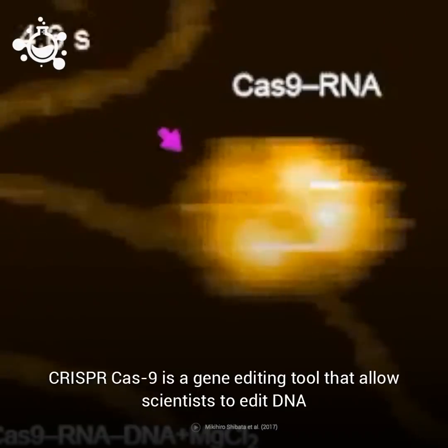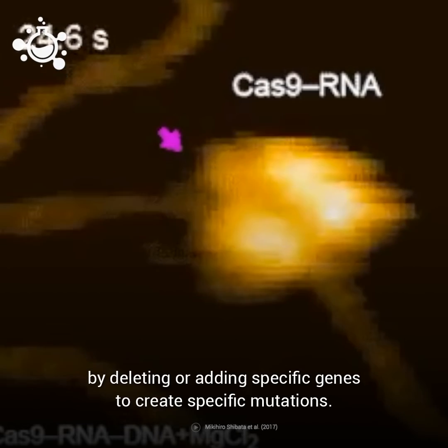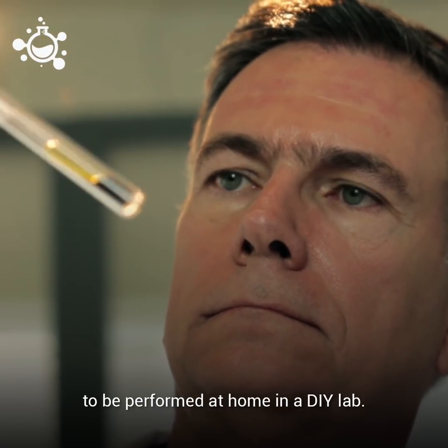CRISPR-Cas9 is a gene editing tool that allows scientists to edit DNA by deleting or adding specific genes to create specific mutations. It is a remarkably precise, step-by-step technique that's easy enough to be performed at home in a DIY lab.